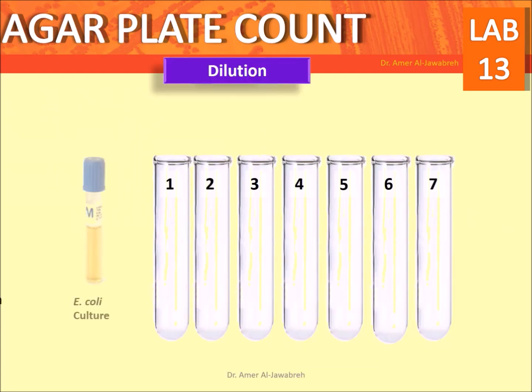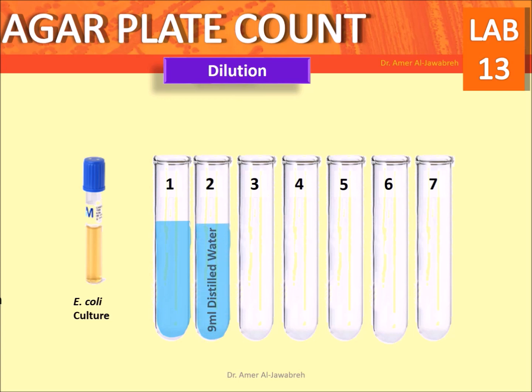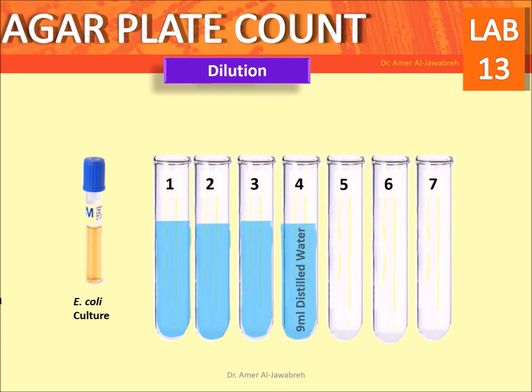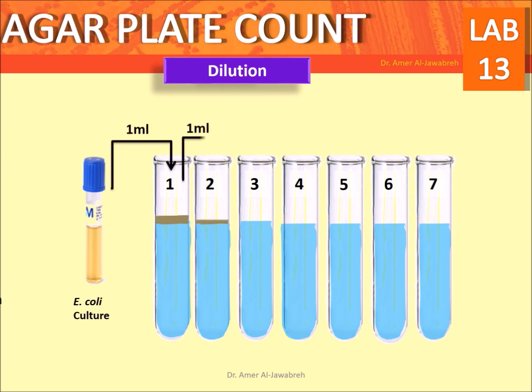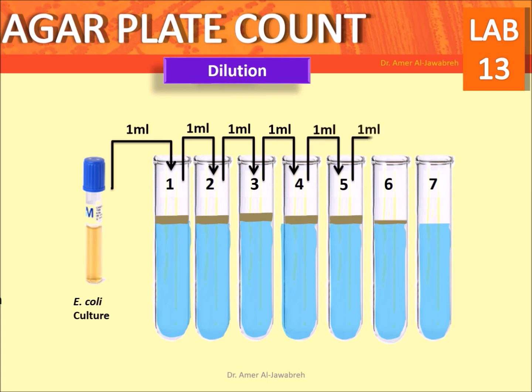Dilution procedure: take 7 tubes and add 9 ml of distilled water in each one. Add 1 ml of E. coli culture broth and add to tube 1. Mix, then transfer 1 ml from tube 1 to tube 2, and so on until tube 7.